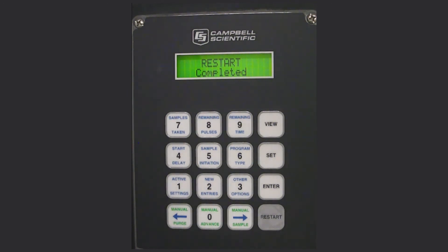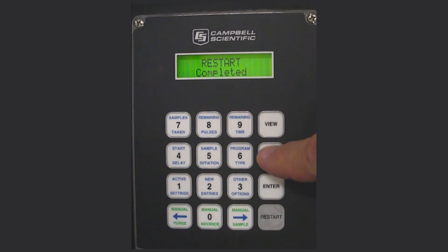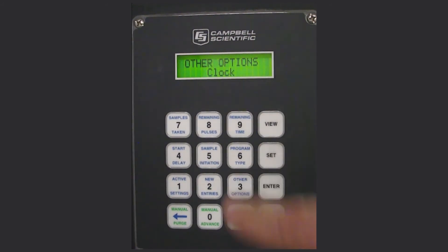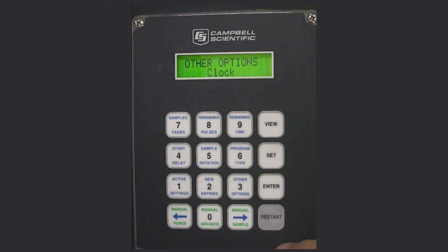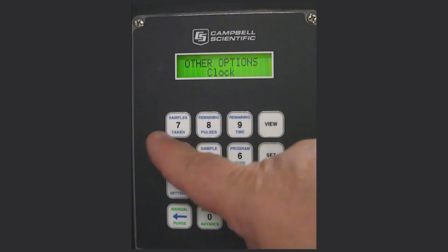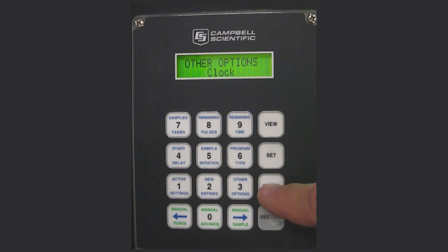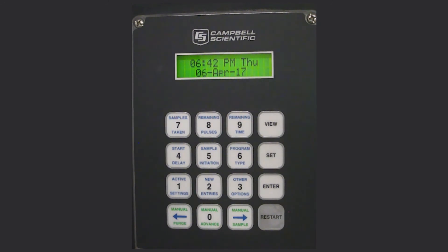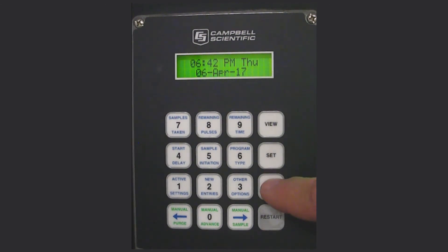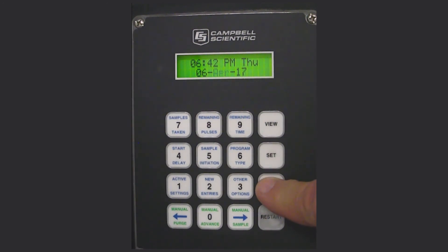Now one other thing to check is the purge time, but first let's verify the clock. Press SET number 3 for other options. If the power has been off, you've had to reset it, or the battery has gone dead, you may want to check the clock — press enter. In this case it shows the 6th of April 2017 at 6:42 PM, which is correct. By pressing enter you can change options including AM, PM, the day, the month, and the year.